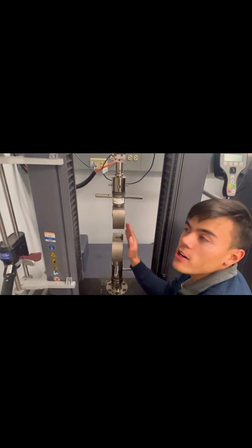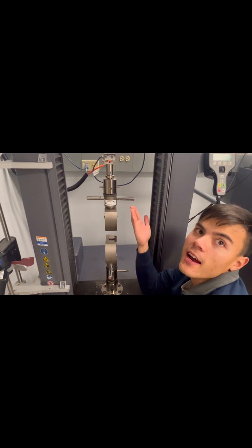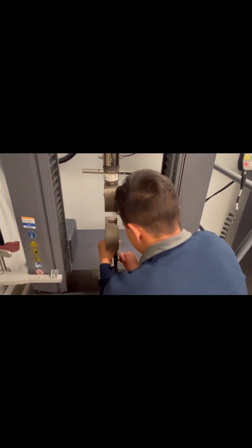After that, you have to secure the two wires to the device. And then we want to orient both our universal tensile machine jaw grips in a 90-degree orientation. Pull it up a little bit.